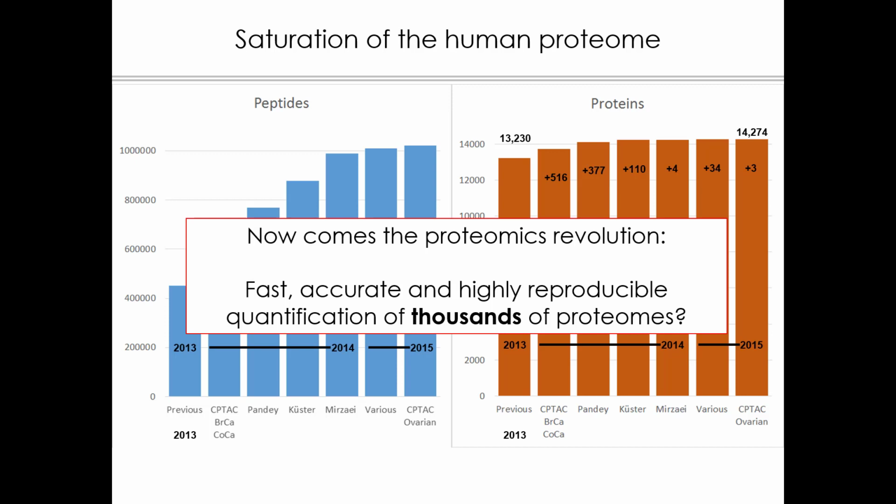If we talk about proteomics, we still are unable to claim that we can identify every protein in a proteome, and it caps out around this. The coverage of the human species caps out around 14,000 to 14,500 proteins. What the rest of the proteins are doing, whether they are expressed, and why we don't see them is actually an interesting question, and there are whole groups trying to figure out why this is. Is there some technical bias? Is there biological bias? Or some kind of combination?